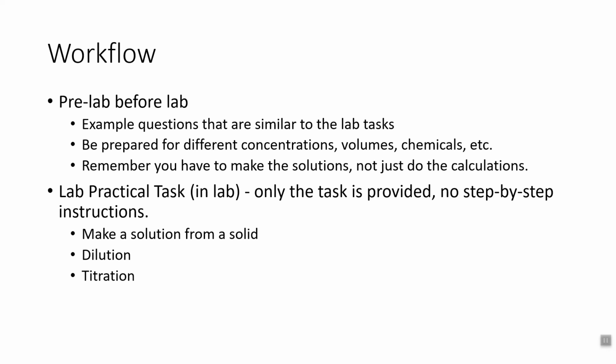So it's really just 2 tasks. The first is making a solution from a solid, and the second one is a titration, which also involves a dilution. So basically you have to dilute something and then titrate it.